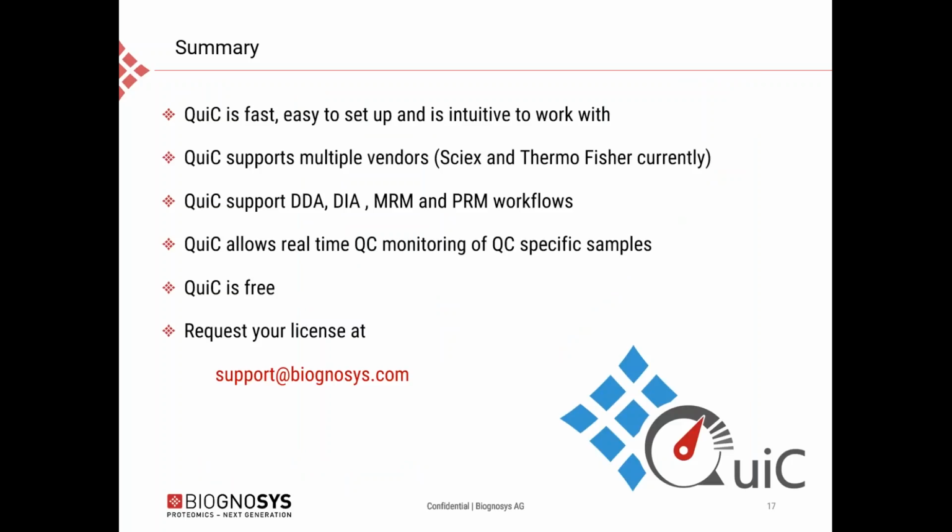This already brings us to the end of this very fast presentation about our QC analysis tool. As I said, QuiC is fast, it's easy to set up and intuitive to work with. It supports multiple vendors, at the moment Sciex and Thermo Fisher instruments. It supports all major workflows from DDA, DIA, MRM and PRM.